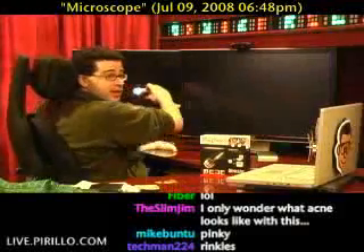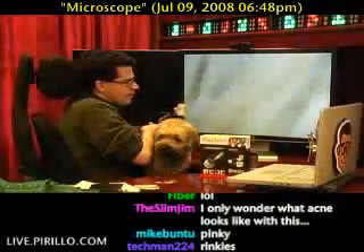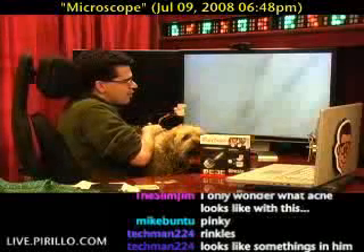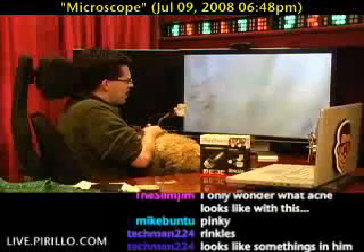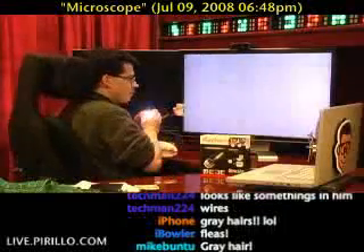Let's take a look at Wicket. Wicket's going to join us. We're going to take a look at you now. Don't move, buddy. You're hard to focus because your hair is going a million directions. There's one hair there — that's one hair? That's many hairs. You've got microscopic hairs. No wonder you're so soft. Thank you for being soft. All right, that's enough.